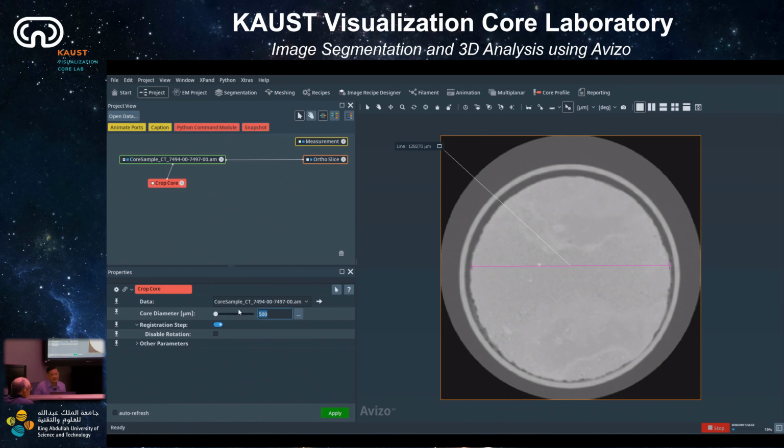I think by default, this is kind of annoying. You have to click on the 3 dots here. When you click on the 3 dots, then you can change the maximum value from 500 to 200,000, for example. You can see that in the box, right? You can input the new max value to 200,000, because you see here it's 128, and then I want to input 127,000.